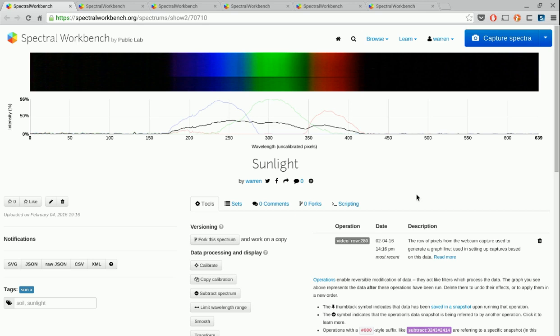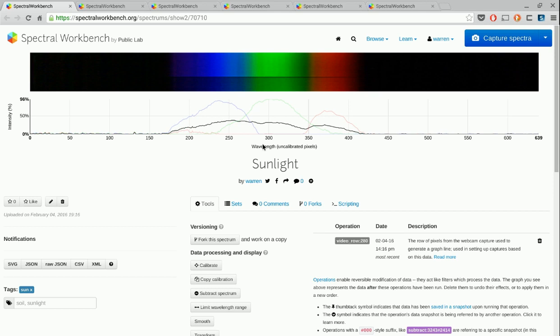Hi. Let's talk about calibration in Spectral Workbench. When you've captured a spectrum, it might look like this, as one of sunlight. And what you notice is that along the bottom here, it shows just the number of the pixel from the left to the right edge of the image. And it notes that these are uncalibrated.